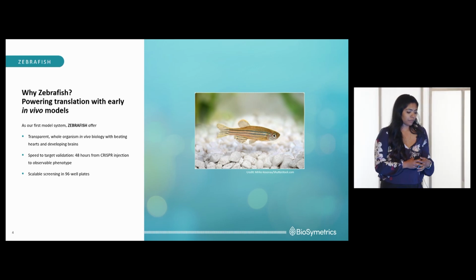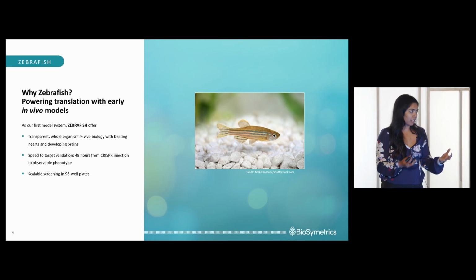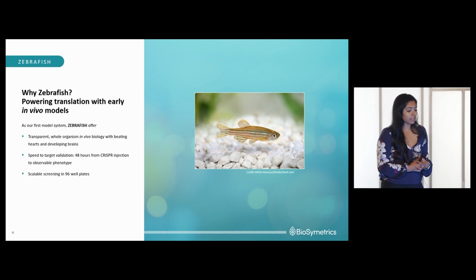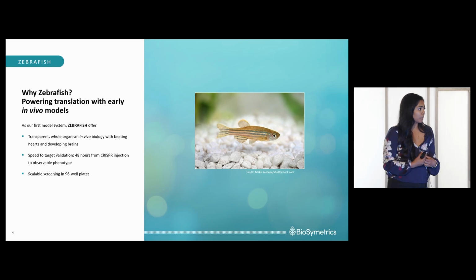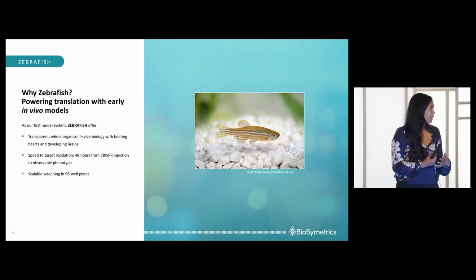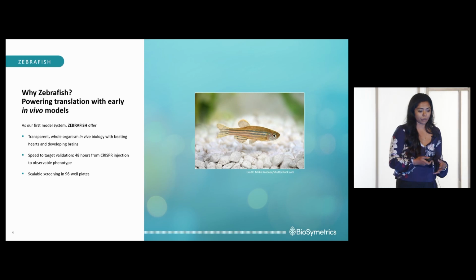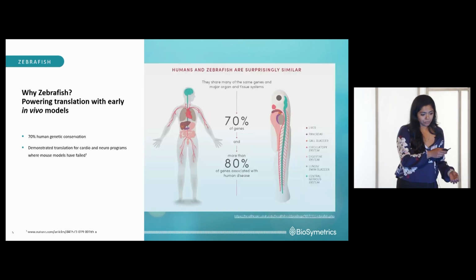The overall zebrafish apparatus is fairly scalable. So you can basically screen up to 300 fish in a single 96-well plate, which makes it a great model for high throughput and reproducibility purposes.